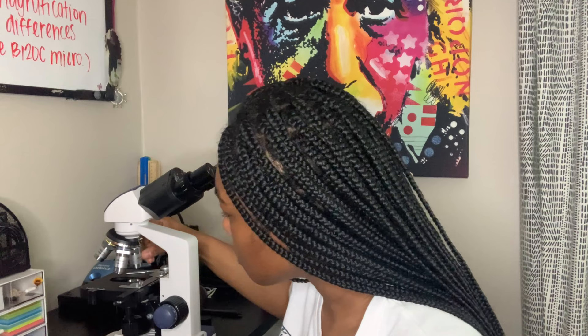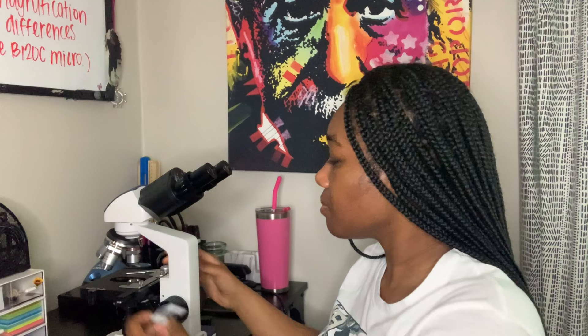Now let's actually look at some observations. Before we do, I really just wanted to show y'all how to look at your microscope with both eyes instead of just one — this is for the people who don't know, because I was one who didn't know. I'm going to put the Coprinus mushroom on the microscope and take a look. You always start with the 4x. Make sure it's rolled all the way down, put it on, and let's start it up.